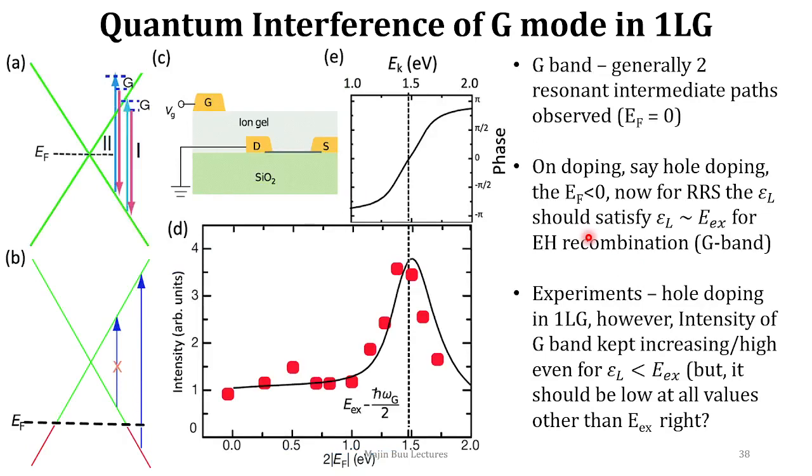With this resonance Raman spectroscopy, a particular study was conducted wherein they wanted to comment on whether the incident electromagnetic wave possessing energy similar to the resonance energy is what is contributing to the G band, or do we have interference from the other energies also?